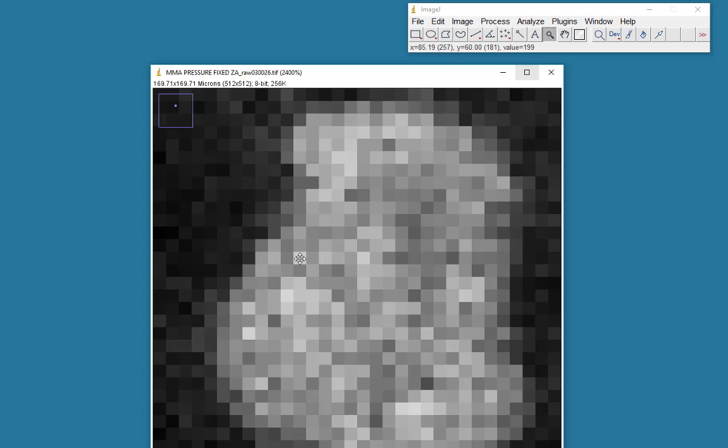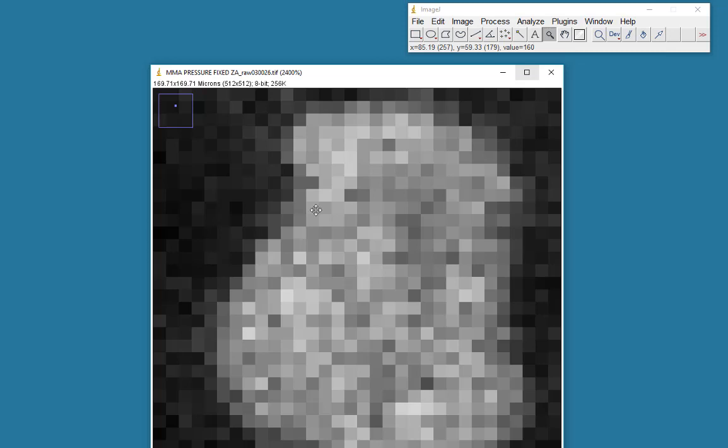And what we do is we color those pixels dependent on the intensity value. So in this case, as you can see, the pixels have different shades of grey, which are determined by the intensity. So in this image, there is an 8-bit image. There are 256 values. We're using a grayscale lookup table, and therefore this image has 256 different shades of grey.